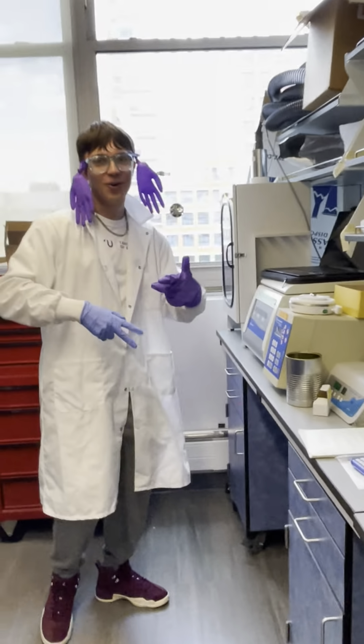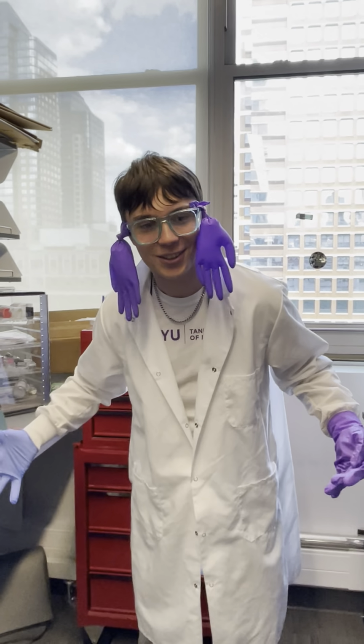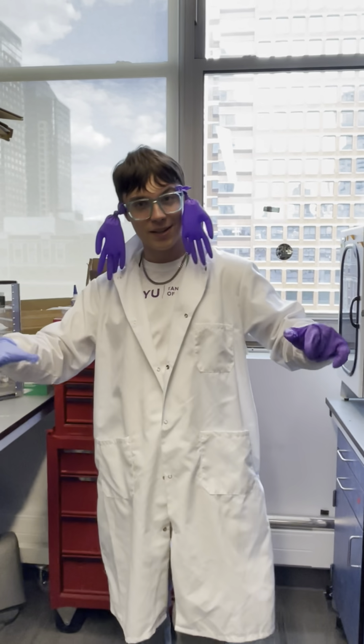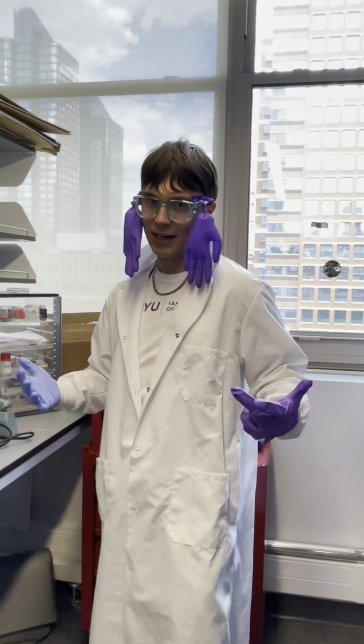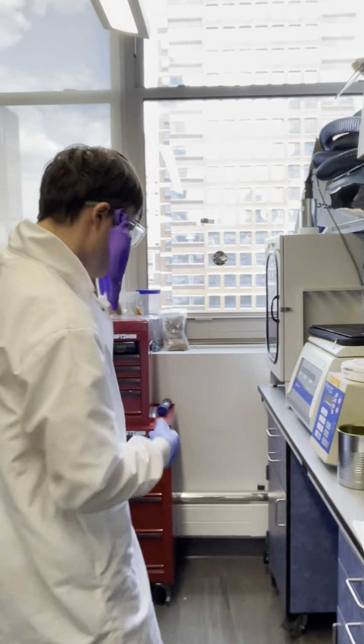Okay. So this is our workstation. This is where all the magic gets done, you know? So what battery specifically is the one that charges quicker, you ask? Well, let me tell you something. It's lithium manganese oxide. So the magic that specifically happens in this lab is preparation of lithium manganese oxide and lithium titanium oxide batteries. So what happens is that we have specific chemicals over here.